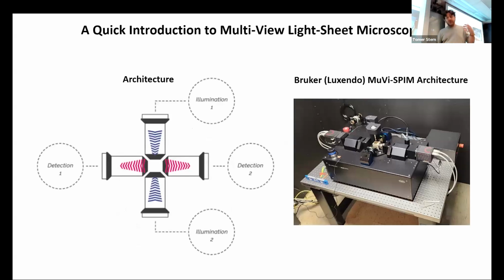Okay. Before we start with the algorithmic, you need to understand how we get this data because, you know, for the last 20 years, we had confocals that basically dominated the biological microscopy, and people did and still do fantastic work with that. But if you want to go to whole organism imaging, confocal will penetrate more or less 50, 60 microns into the tissue. It will take plenty of time to do that because it's a point scanner. At each time point, it's taking only one pixel. And it will also bleach your tissue. So you can, by definition, not do anything whole fly embryo with confocal.